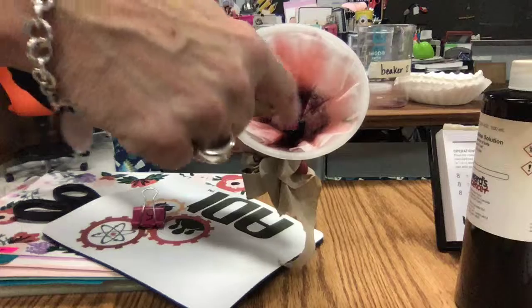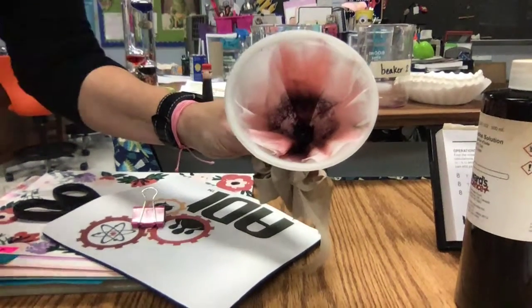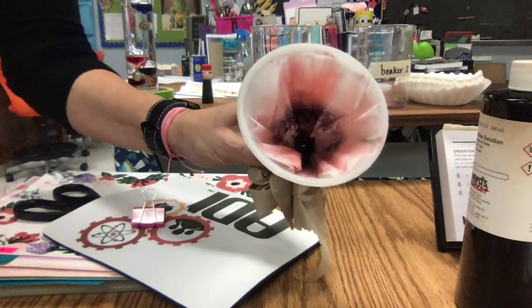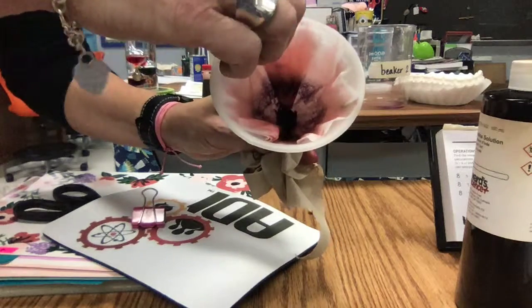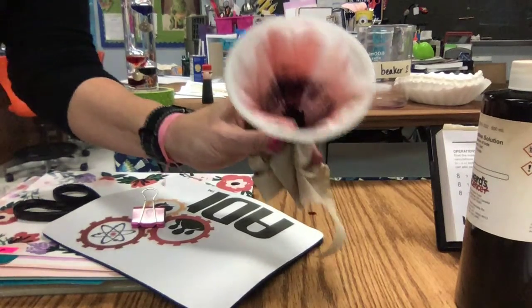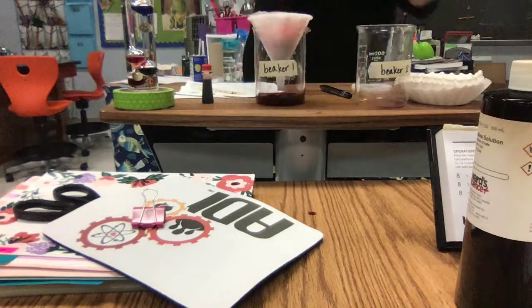All right, so all that, you can see all of the residue, all right, which in this case is cornstarch, okay? But remember, you're trying to figure out what this filter paper is representing, and now what is all of that residue in there? What is that representing, okay?